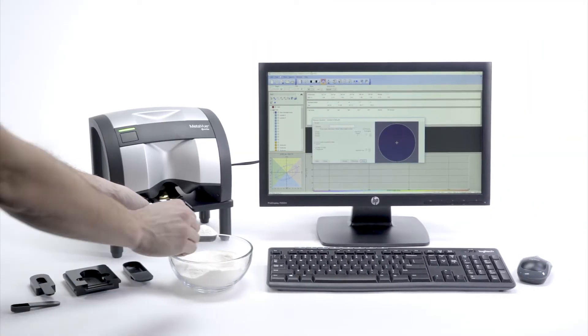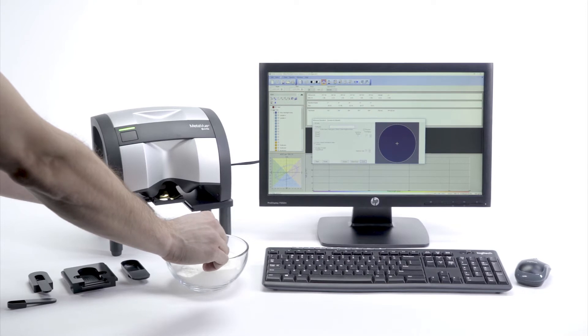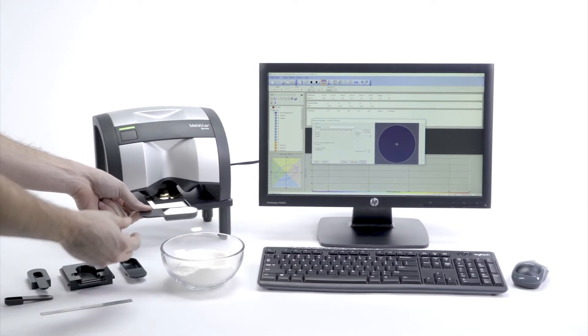If you have odd-shaped items, X-Rite can produce custom sample holders to secure your items for consistent measurement.